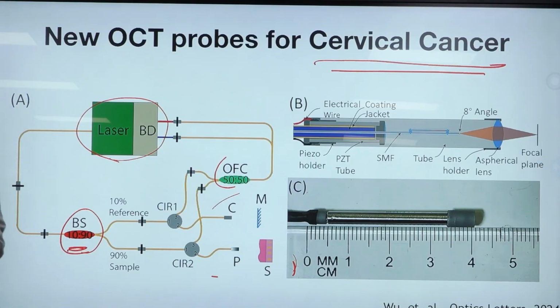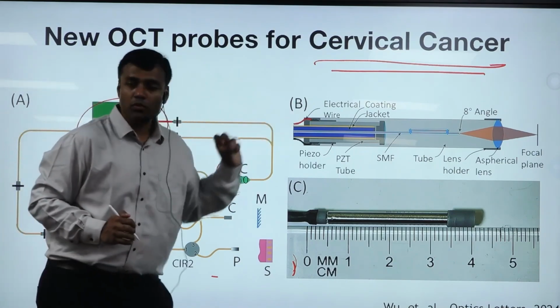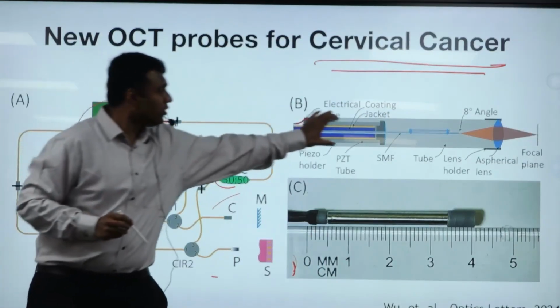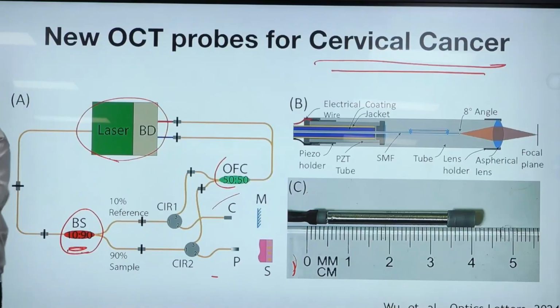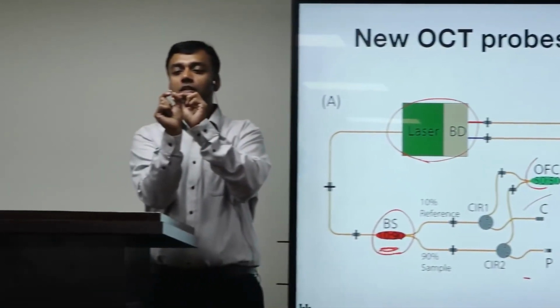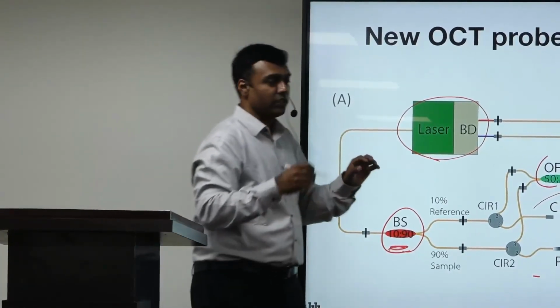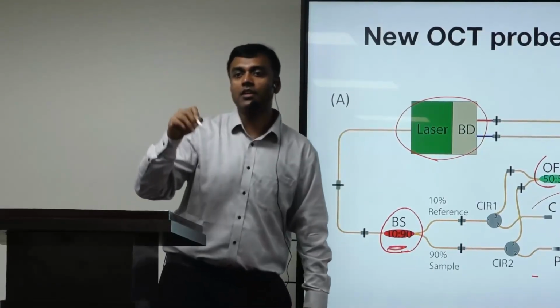In this case, we use the second version, where you apply an electric voltage, and that will result in a deflection. Okay, so this is a thin tube, imagine a cylindrical tube of this sort. Top and bottom there are two electrodes. You apply a voltage difference across this way, then the tube will deflect in that direction. There are another two electrodes here. You apply a voltage here, it will deflect. So you have both x-axis and y-axis control.